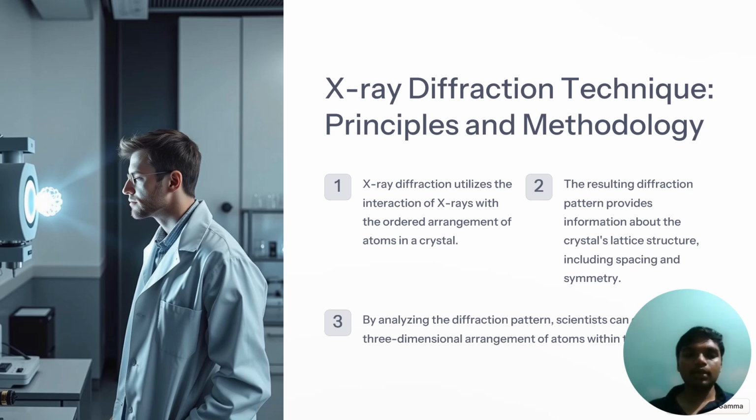The second one, X-ray diffraction. Once a high quality crystal is prepared, it is bombarded with X-rays. X-rays have wavelengths on the order of the distance between atoms in a crystal. When the X-rays interact with the electrons in the crystal, they scatter in specific directions.